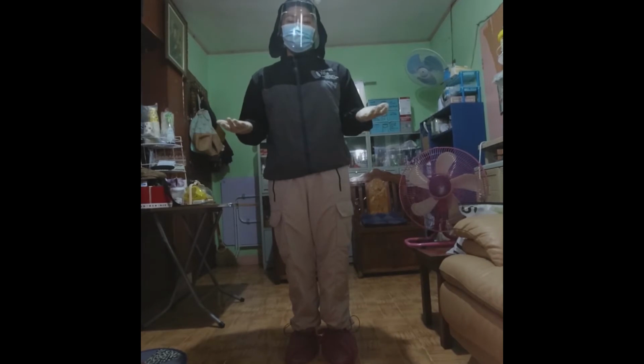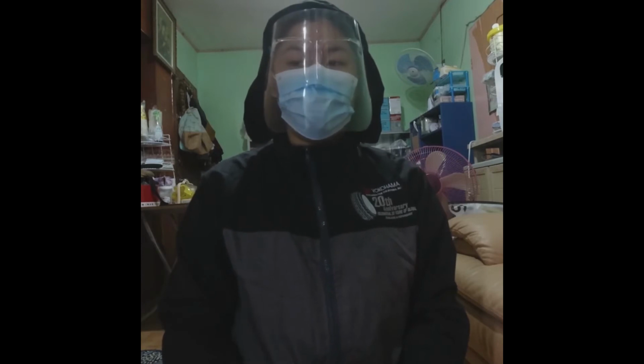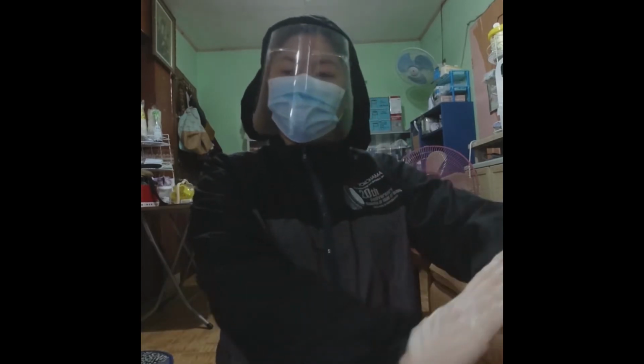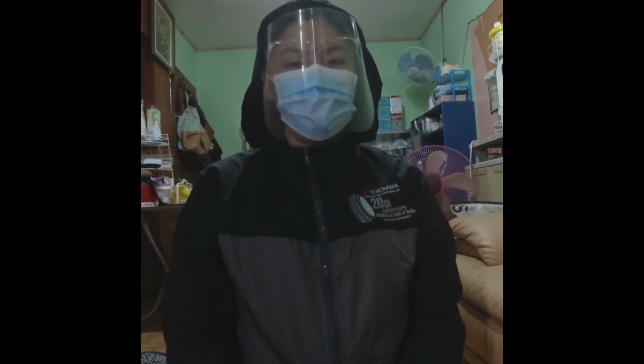Next part is the protective clothing for the torso, which is a windbreaker. One advantage of this over the normal gown required as part of the PPE used in the Biosafety Level 2 microbiology laboratory is that a majority of it is waterproof. Therefore, it is somewhat effective in protecting the handler from microbial contamination.